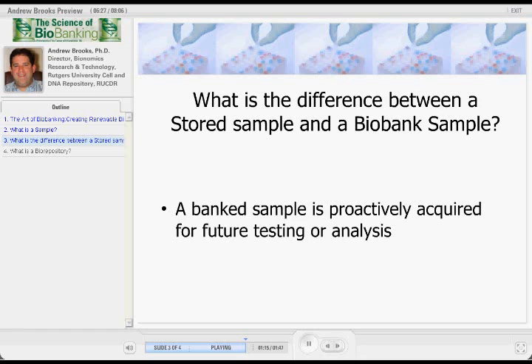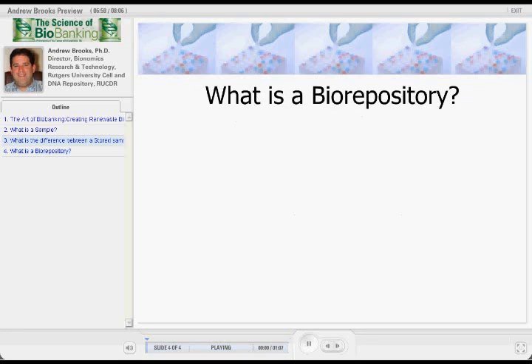Again, when you're operating or running a repository, storage is a big component of what you do. It's everything else in a biobank that I think kind of presents challenges that need to be addressed in either protocol development or in operational requirements. Not that companies or labs that store samples, that there are no challenges associated with it. There are many. But when you biobank samples with respect to manipulating them, processing them, distributing them, and being responsible ultimately for their quality, I think that's where it presents unique challenges. So what's a biorepository?